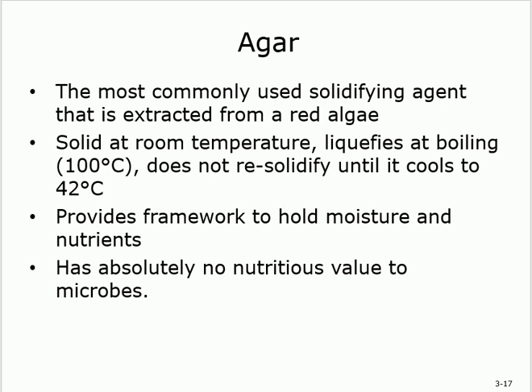So mentioning the solidifying agents. Some of these media are semi-solid and contain solidifying agents, and the solid contains solidifying agents. What's a solidifying agent? An agent that can change the physical state into solid. Agar is the most common one. The agar is the most commonly used solidifying agent, and they get it from the red algae. Remember it? Agar, algae. Agar, algae. Okay? They get it from the red algae.